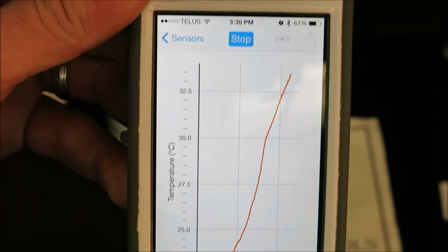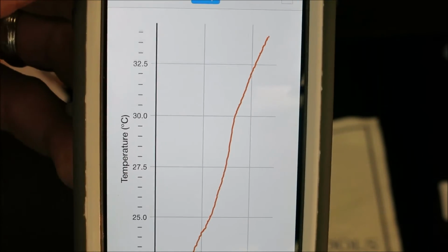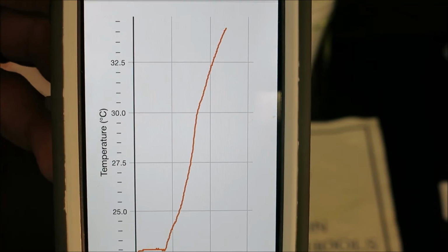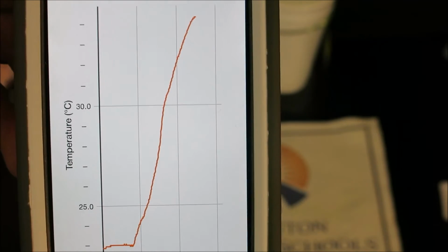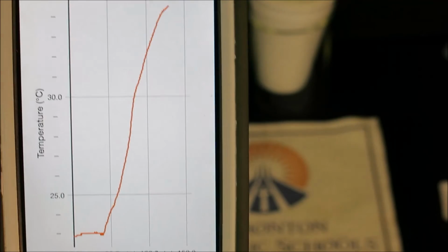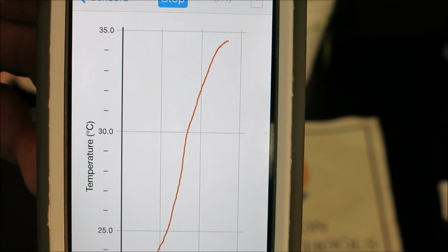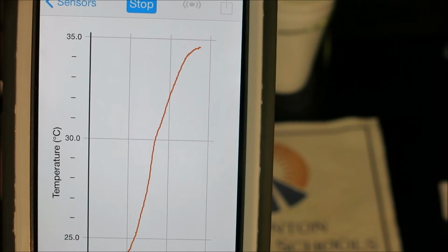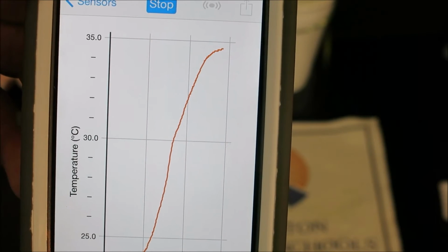It is important to be patient to gather the highest possible temperature, as the temperature change is part of the error that can occur when calculating enthalpy. Using a digital thermometer such as this one, we have very accurate readings for temperature change. And we can see there that the temperature begins to plateau.